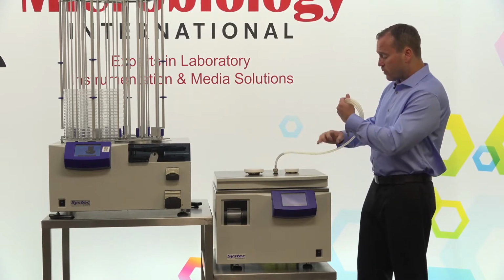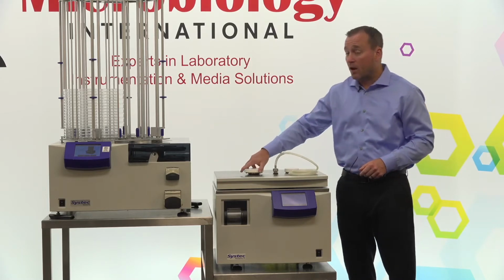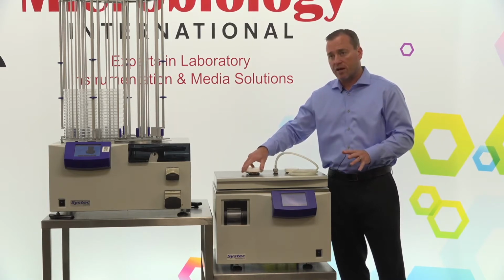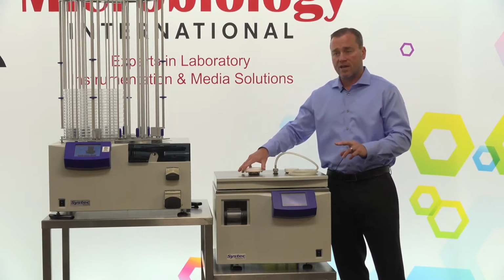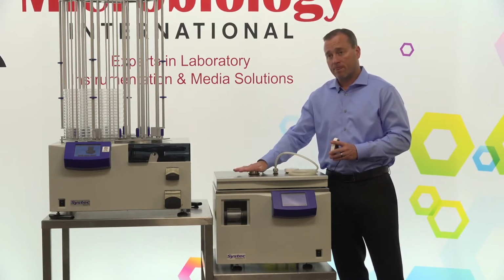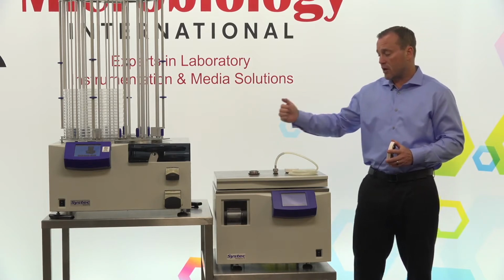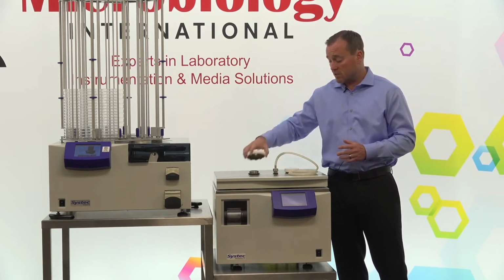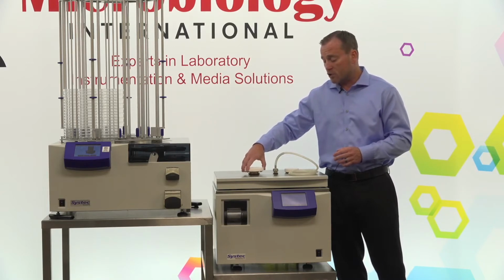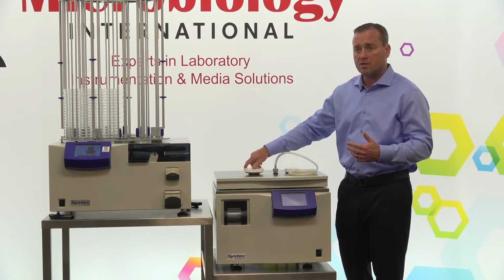The second port that we have is for any components that are thermolabile. So if you're adding blood, or if you're adding any antibiotics after the cycle is complete, or at a stage, then you can add them through the larger port here. Those can be brought up into a pipette in a hood and then transferred over and dispensed into the system. There is programming available for us to stop this unit at a specific temperature that would be safe for any of the components that you want to add.